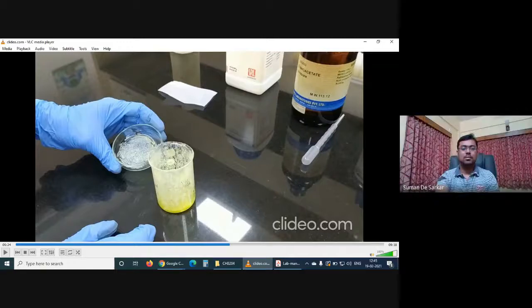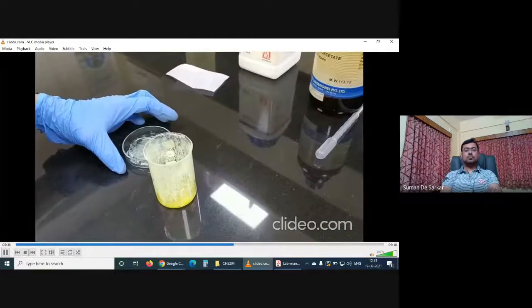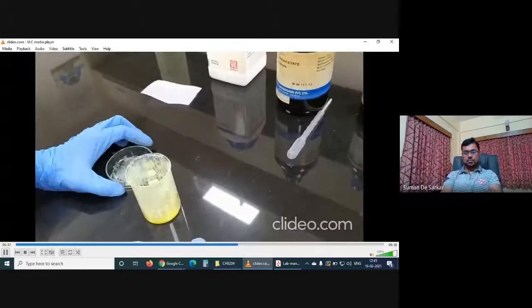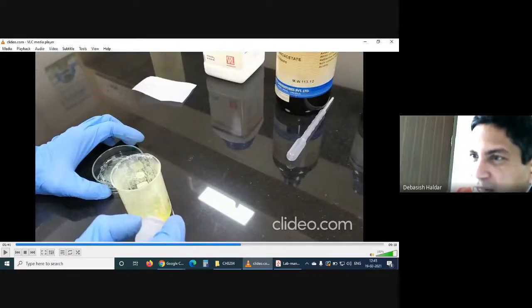We took the beaker from the microwave oven, and now we cool it down, so it is now at room temperature, and we are adding ice to this reaction mixture. So students can see that we have started with a liquid and now everything got solidified. With just a 90-second microwave reaction, things come out from all sides of the beaker, and that's why we need the lid.